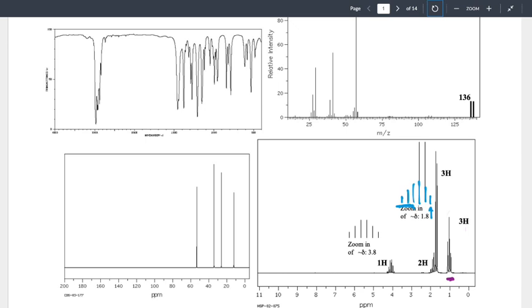How many carbons do we have in my summary? 6. How many am I supposed to have? 4. I can't put it together yet because I have too many carbons, which means there's still duplication. I don't need to look at my HNMR now. I have to look down here and say, where do I have duplication? We've addressed the CH3s, which means we need to navigate to something else.